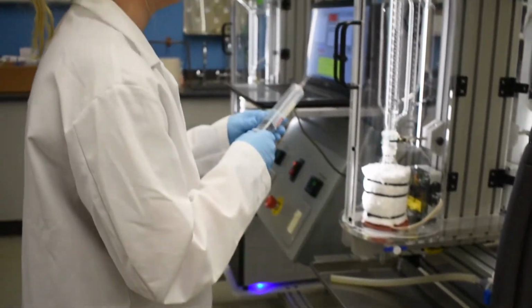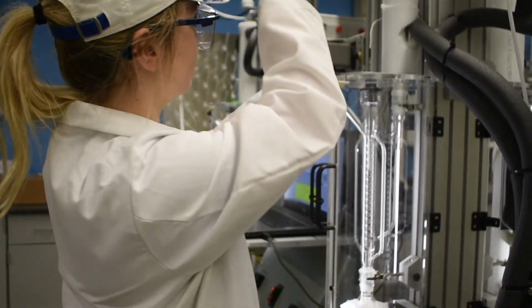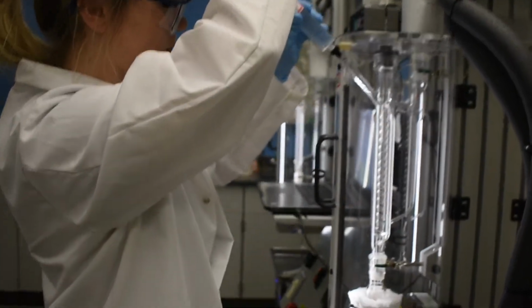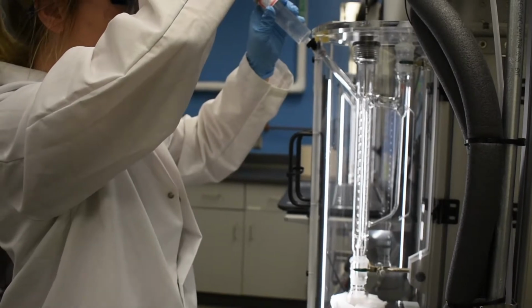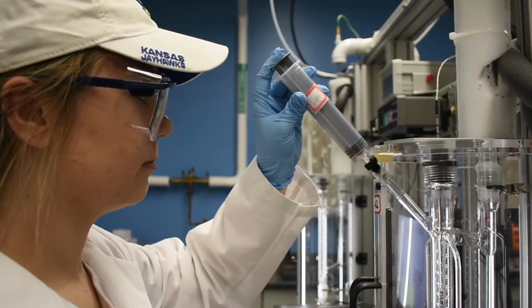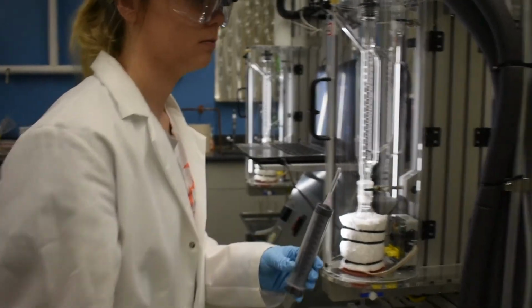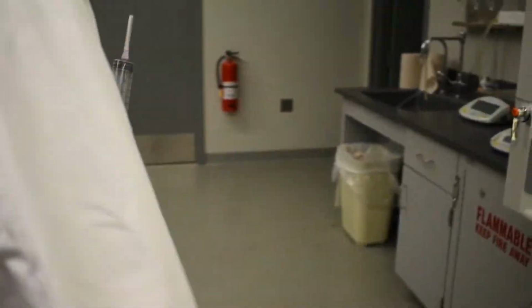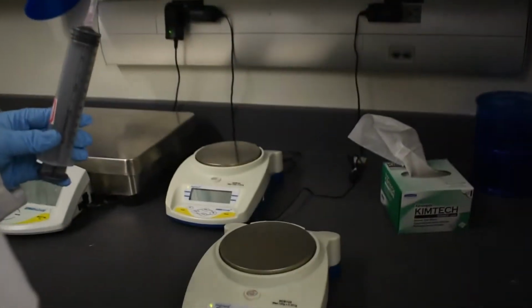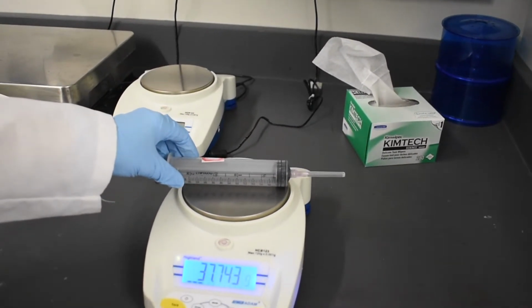Inject the solvent through the injection port by gently piercing the septum. Keep in mind there is glassware around the port, so limited force should be used. When finished, recap the syringe. Mass the empty syringe in order to find the amount of solvent injected into the ebullirometer.